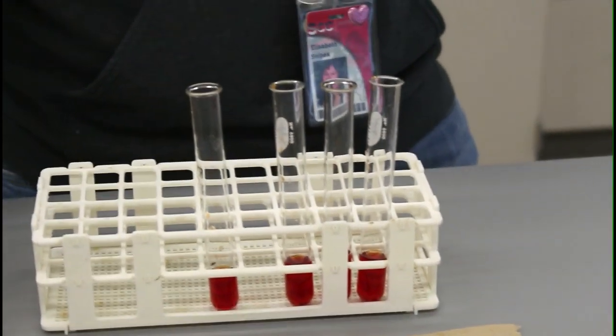and we'll see what we got going on here. So to the first test tube, I'm going to add more reactant in the form of iron 3. Okay.